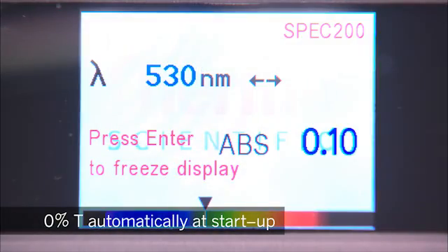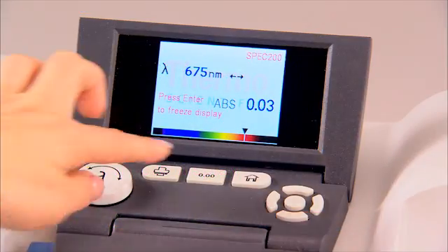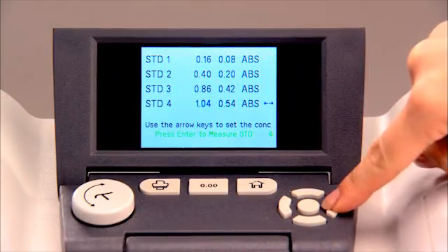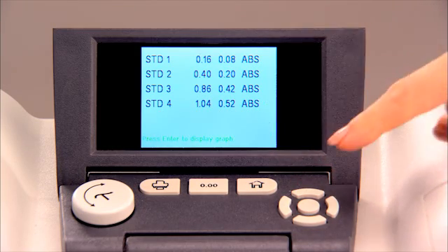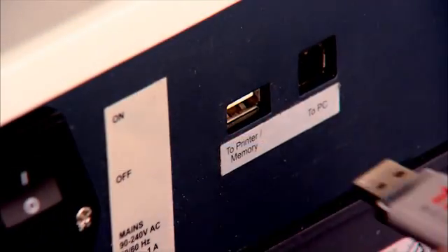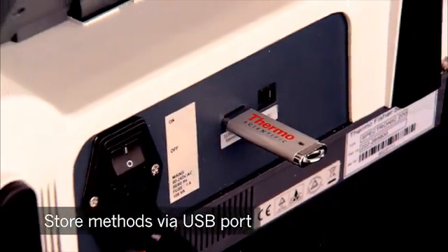0% T measurement is done automatically at startup, and the AutoZero function records 100% T at all wavelengths. Set up a quantitative method with a user-entered factor, or up to four standards, to make a Beer's Law plot. You can even store your methods to a memory stick via the USB port for later use.